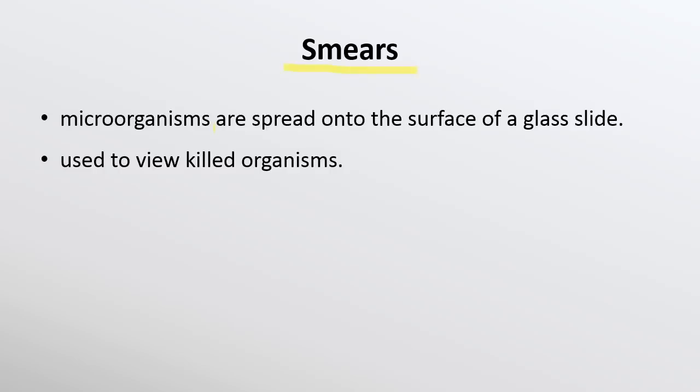So the last one is smears. Usually the microorganisms are spread onto the surface of a glass slide, and then it goes through heat, in order to dry them as well as to kill them.